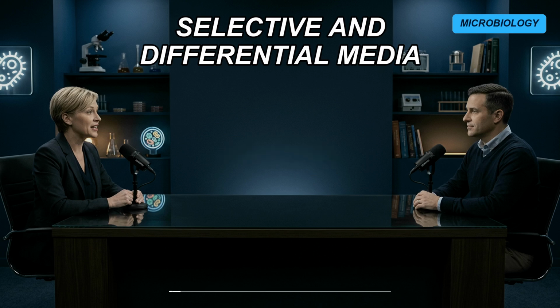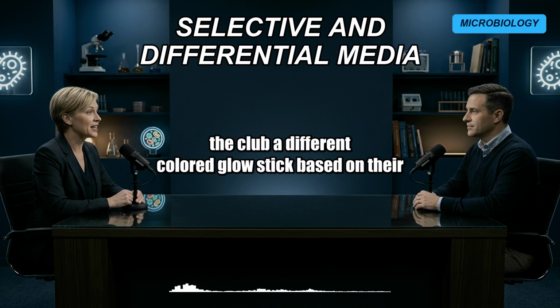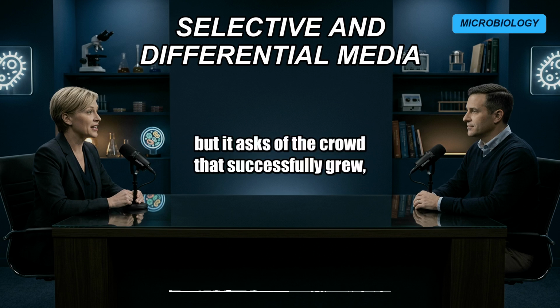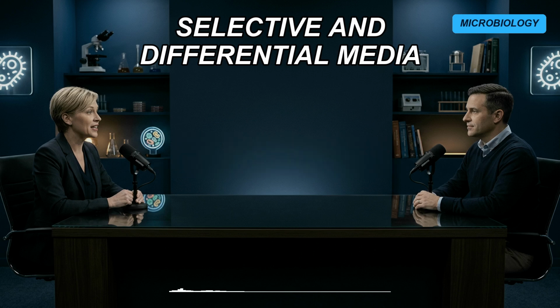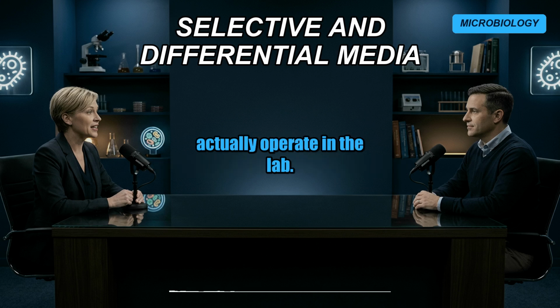On the flip side, differential media is like handing everyone who makes it inside the club a different colored glow stick based on their favorite drink. Lets everyone in, but it asks, of the crowd that successfully grew, which one is which? That analogy holds up perfectly on a biochemical level. It really does. Let's break down how your bouncer and your glow sticks actually operate in the lab.